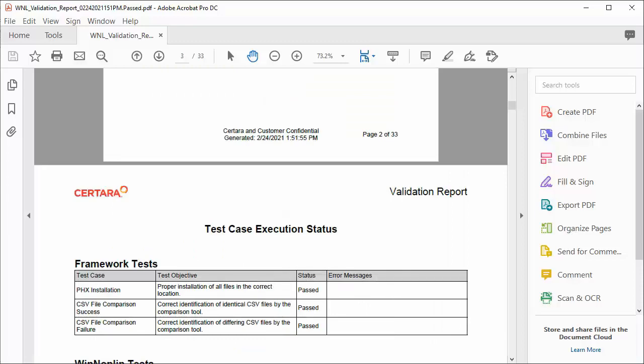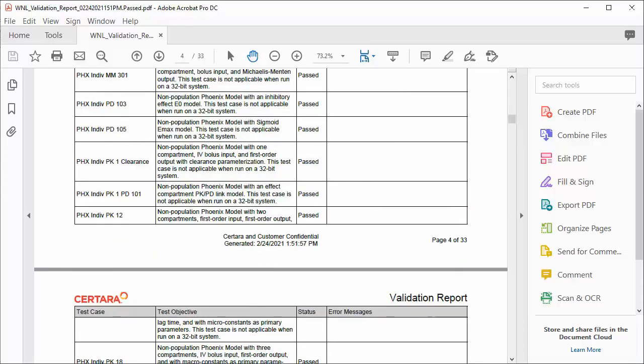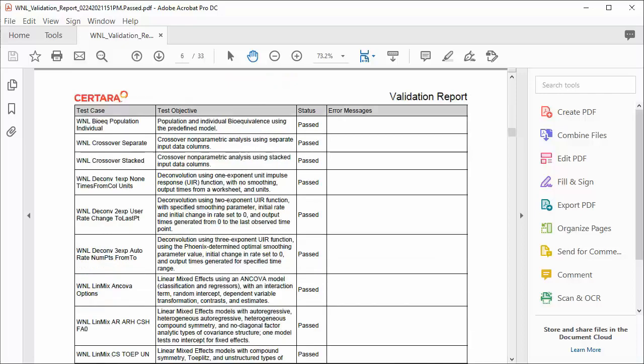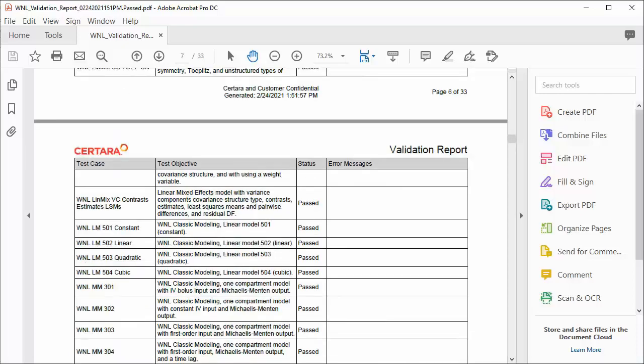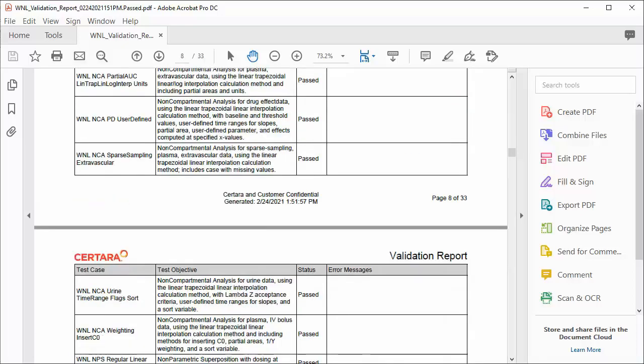There are 83 tests executed in the Validation Suite for WinNonlin, and here we see that all of them have passed. The Validation Suite lowers cost of validation projects by saving time, resources, and effort.